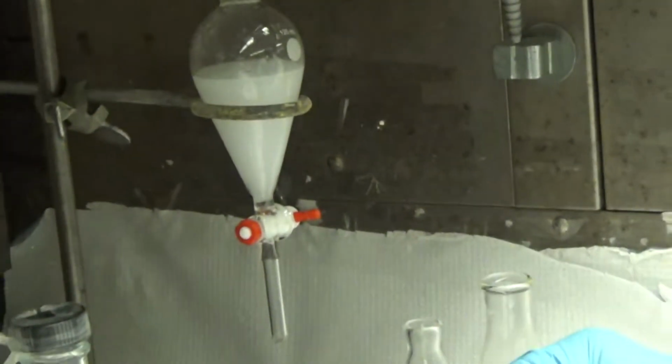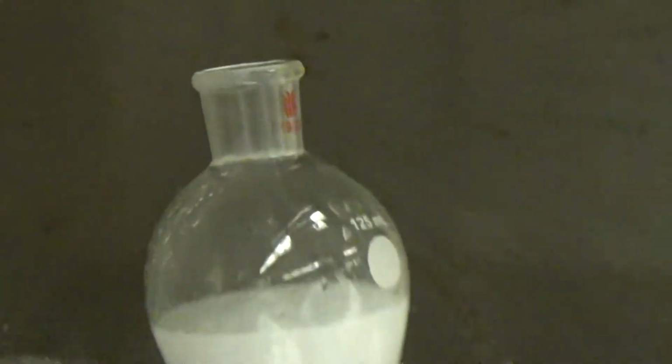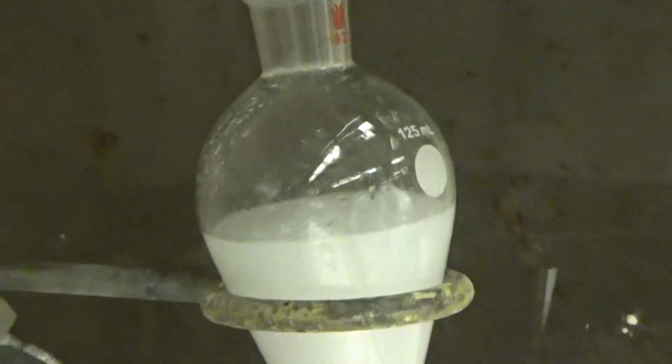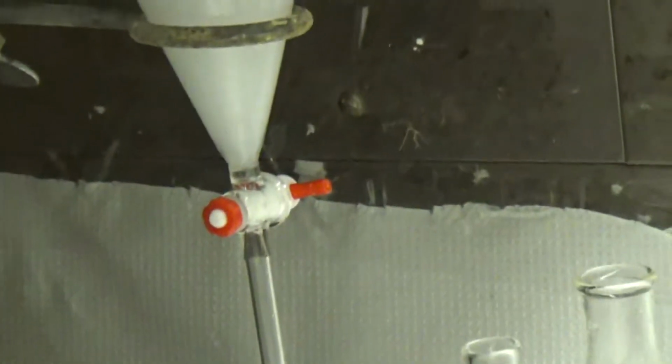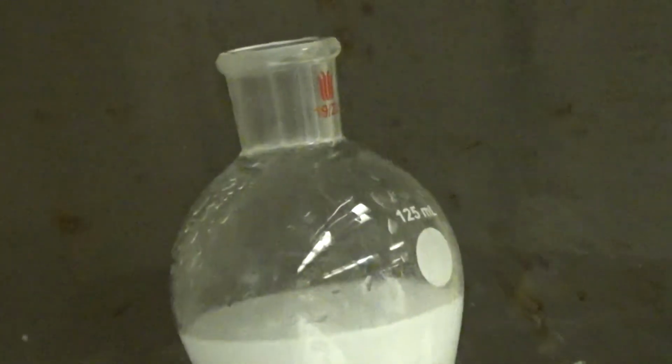And the thing you were saying is you pull the top out because otherwise it creates a vacuum. Yes, that's a classic mistake. Everybody, the first time you do this, you forget to do that, and then it doesn't drain out the bottom because you're clogged at the top. So good thing you didn't make that mistake.